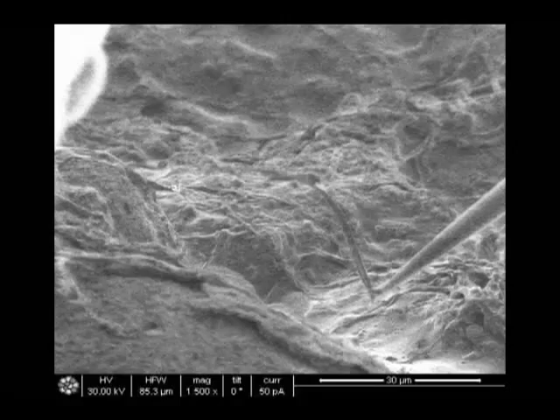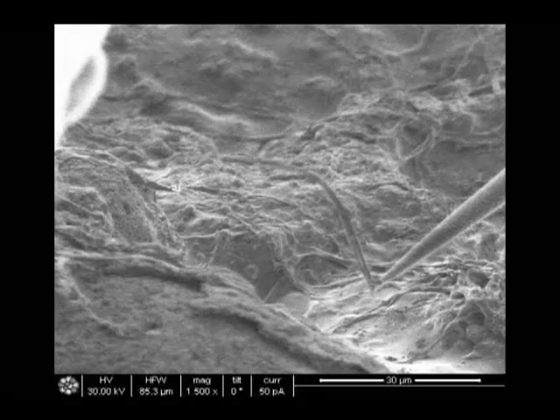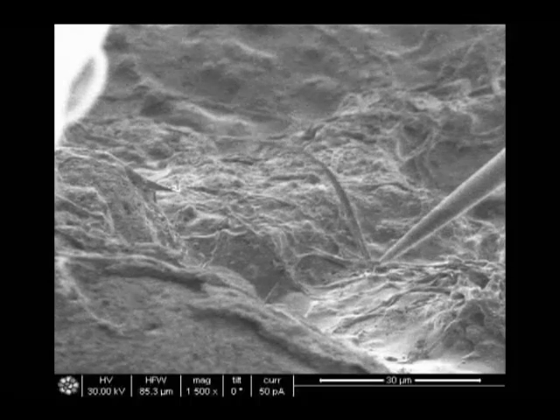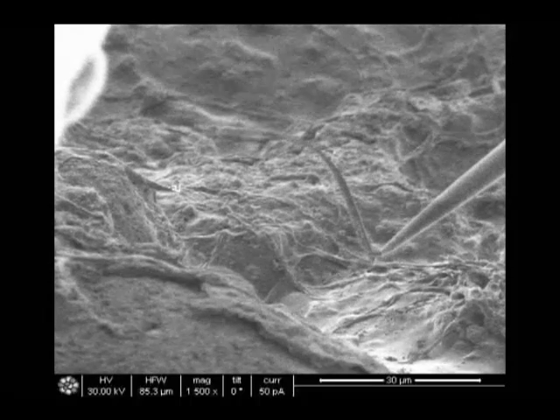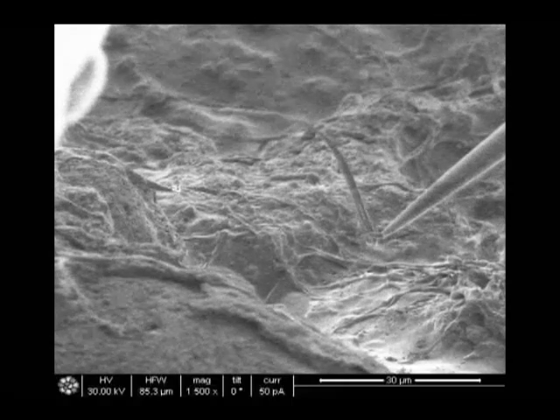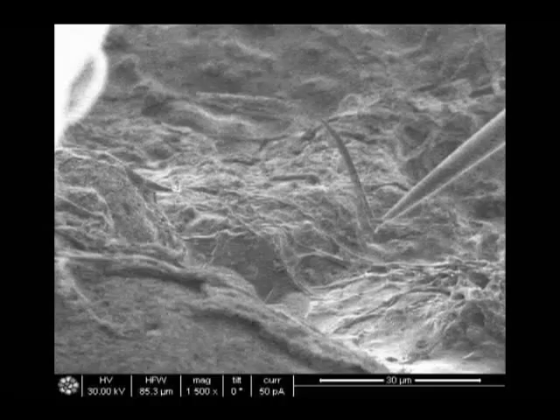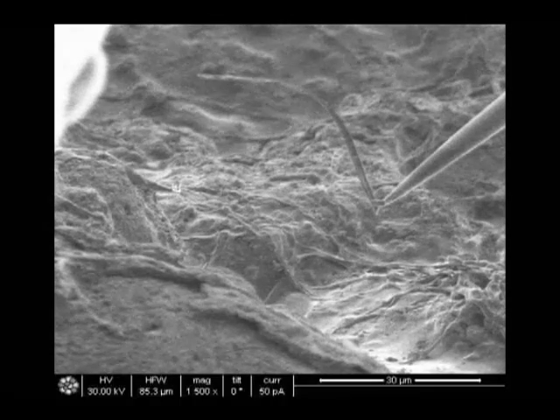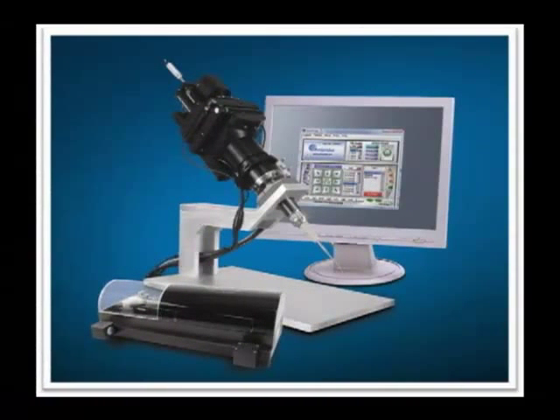This second example shows the removal of a carbon fiber from a biological specimen. The probe is moving up in the z-direction using the stage frame of reference. This requires the simultaneous coordinated motion of multiple motors at once, enabled by encoder feedback and digital control. The user easily executes this by a single mouse stroke through an intuitive software interface.